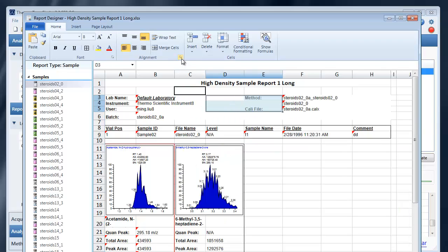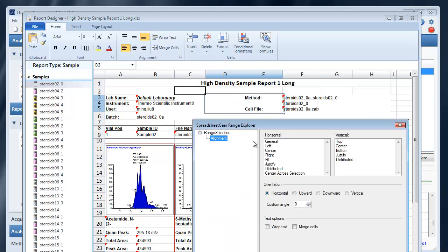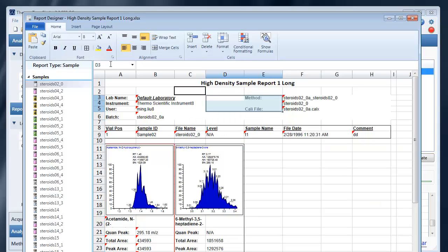You can also click on this icon here to open up the dialog for alignment or the dialog for fonts.